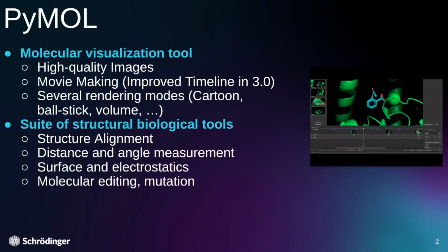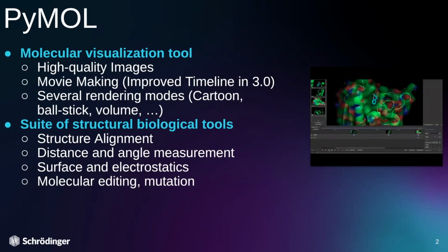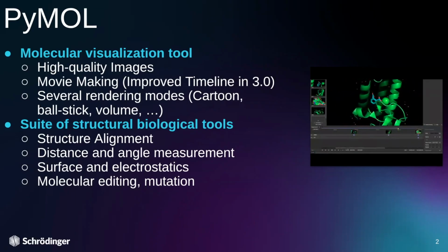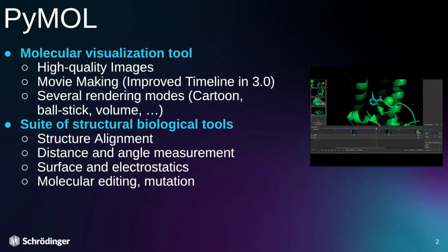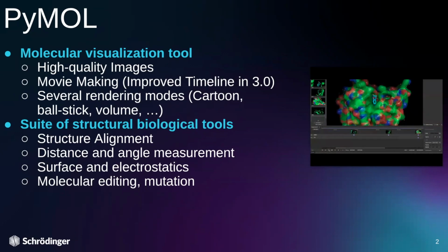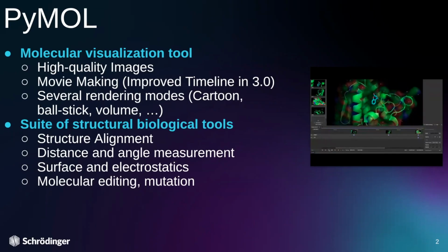PyMOL has a very rich scripting command set. But for people just jumping into PyMOL, a lot of these things are hard to discover. If you give them something like a panel or UI, a lot of these things become much faster to pick up, much faster to iterate through, and cut down on time. You can make a lot more awesome things. It's a lot more discoverable and a lot less reading the manual and figuring out, oh, yes, you can do this. Yes, 100%.